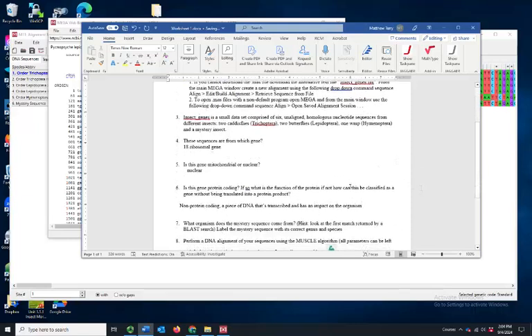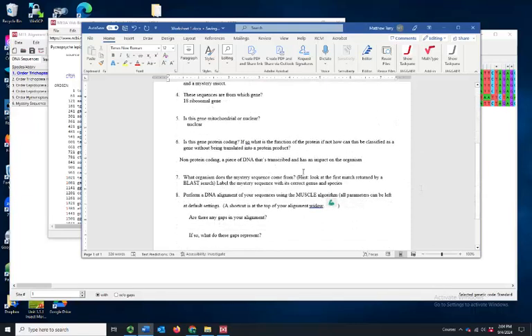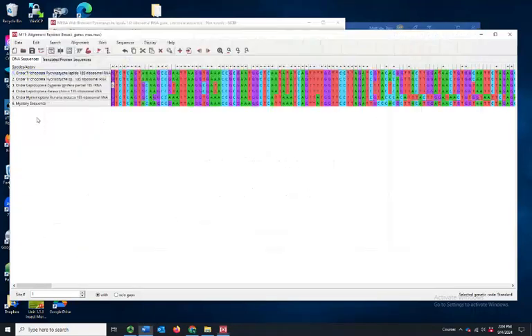Okay, so what organism does the mystery sequence come from? So we've got a mystery sequence that's unlabeled here. Now, even if you just looked at the sequence, you could probably infer that it is an 18S gene, because notice it is quite similar to all of these other ones with a few differences. However, we have a tool. So I'm going to introduce you, if you're not familiar with it, to what's called a BLAST search.